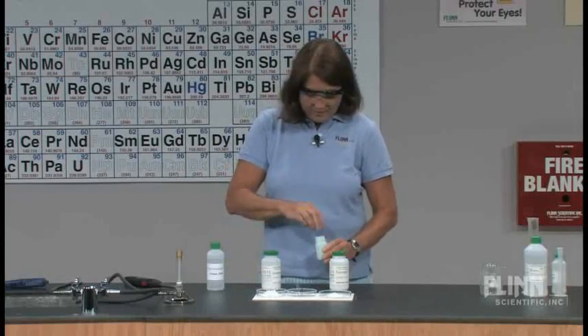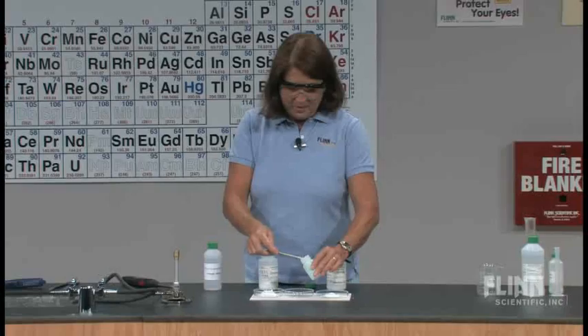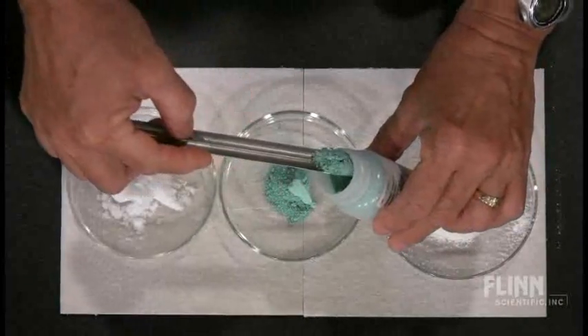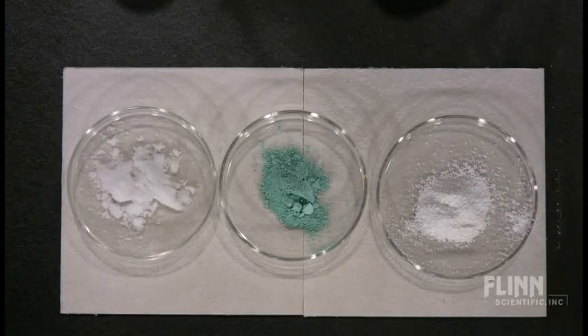I've added quite a bit of the carbonates here. I'm just going to put the copper carbonate into the middle Petri dish now so that all three are ready. And we're going to do these all together. So I'm going to move the bottles over and light the Bunsen burner.